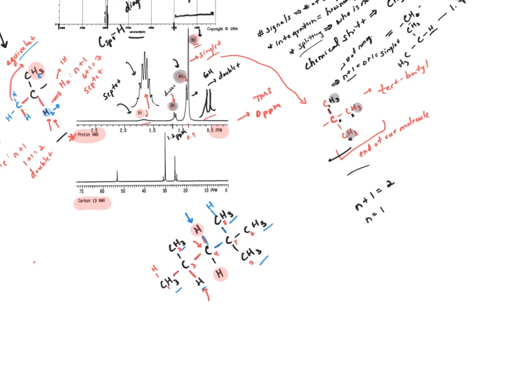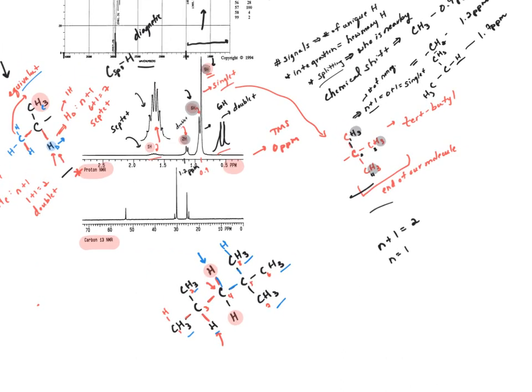So there are a couple of different things that I want you to do, though, in showing me that you solved this structure.